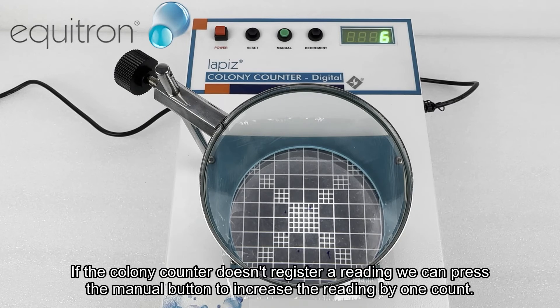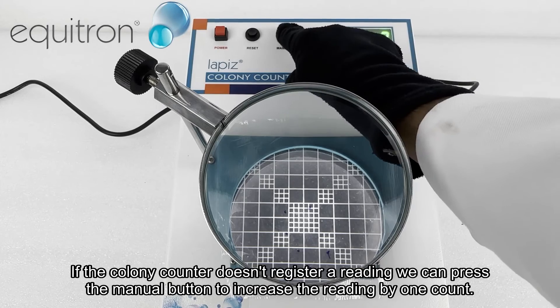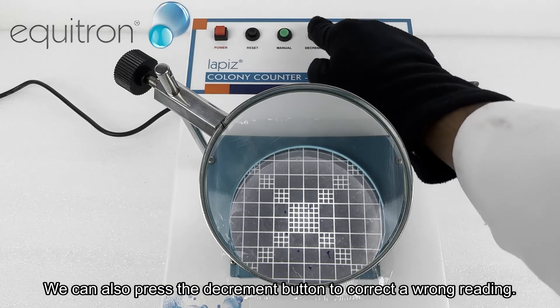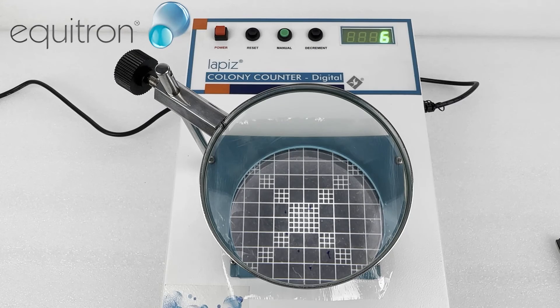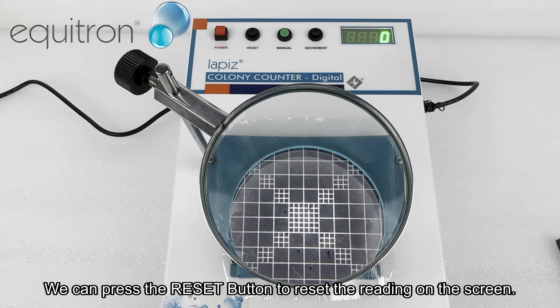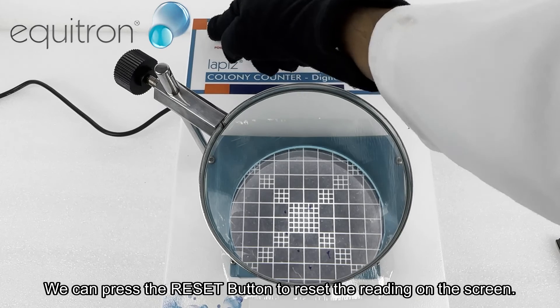If the colony counter doesn't register a reading, we can press the manual button to increase the reading by one count. We can also press the decrement button to correct a wrong reading. We can press the reset button to reset the reading on the screen.